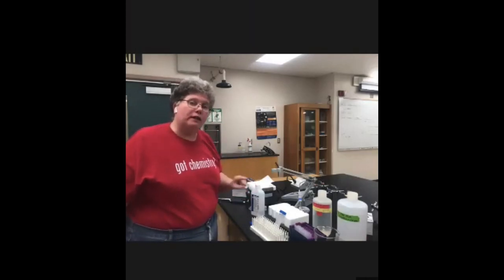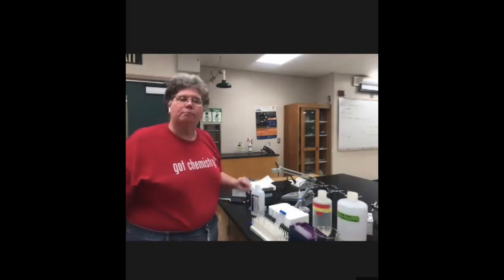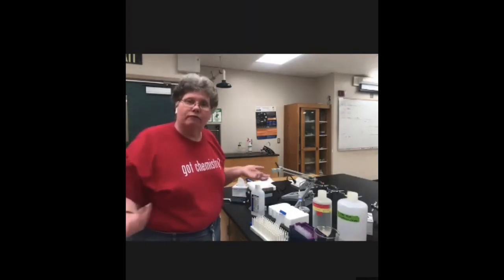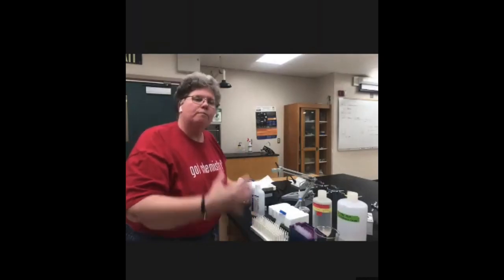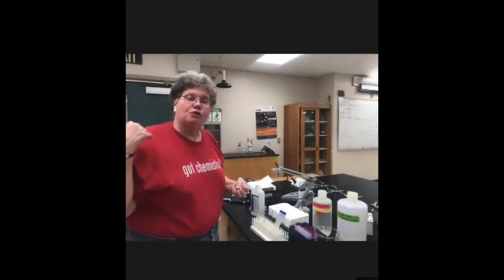It's a little bit better to increase your precipitation of DNA just a little bit. DNA will precipitate even if you don't put it at this cold temperature, but it will give you an extra couple percent of yield. And you always want to try to maximize your yield whenever doing anything. So we're going to pick up after having put this in our ethanol dry ice bath or -80 freezer for half an hour. And then we're going to spin our samples for 20 minutes, and we'll pick up with the video at that point.